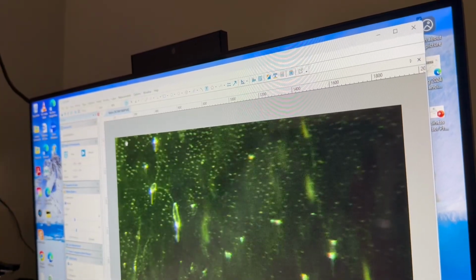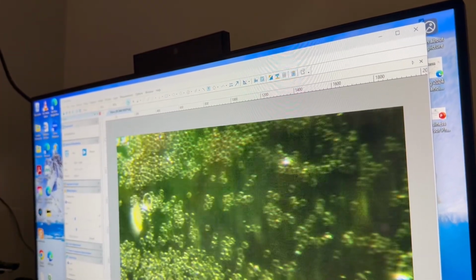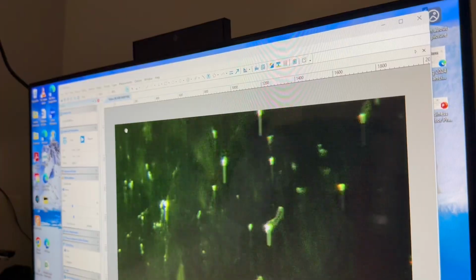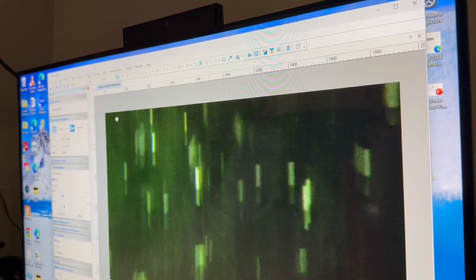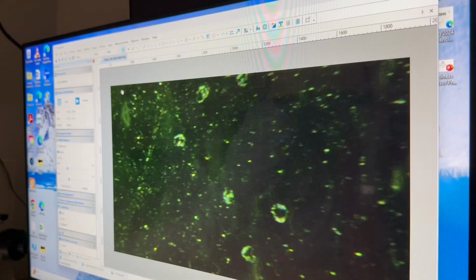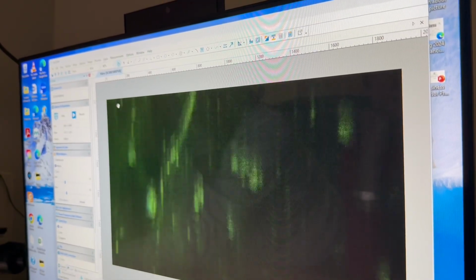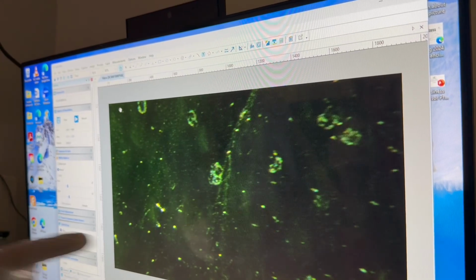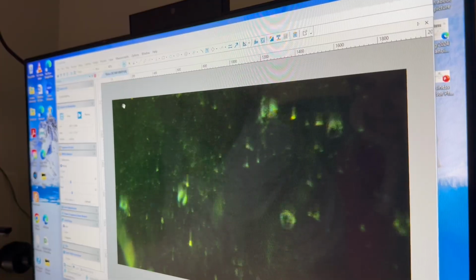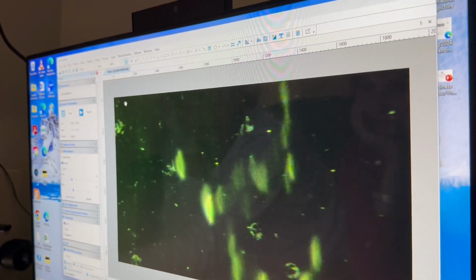Now what I'm moving into is where there's less blood. I'm coming back up into it. And again, this is... There we go. Same kind of thing. Right there. Right in there. Yeah, this thing. And, you know, on one side I've seen other blood that I'd be more concerned about than yours, just to give you a heads up. Looks like your body's doing what it's supposed to do.